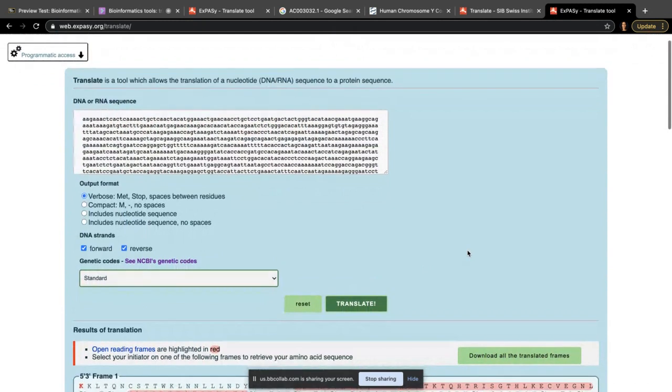What it was doing is looking up these first three nucleotides, which amino acid do they encode? And then the second three, for the first frame of translation. How about the third three? It keeps doing that all the way to the 3,000, then goes back and skips the first, and does frame 2 of translation. So these three, which amino acid do they encode?